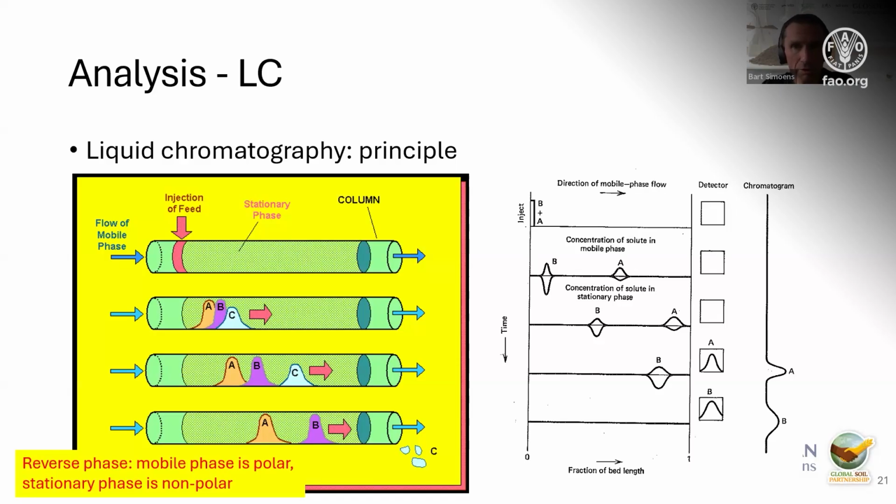And so there are a couple of figures on this slide that explain how it works. Again, I don't think it's the first time you hear it. But in chromatography, we have columns, and for liquid chromatography, compared to the GC, it's quite a thick column, although it's still not so thick, and it's quite short as well, of course.